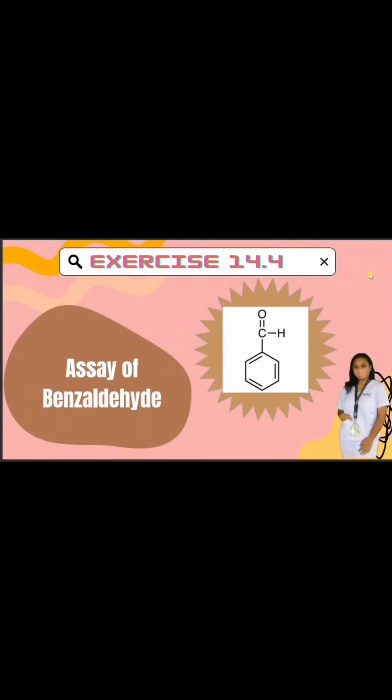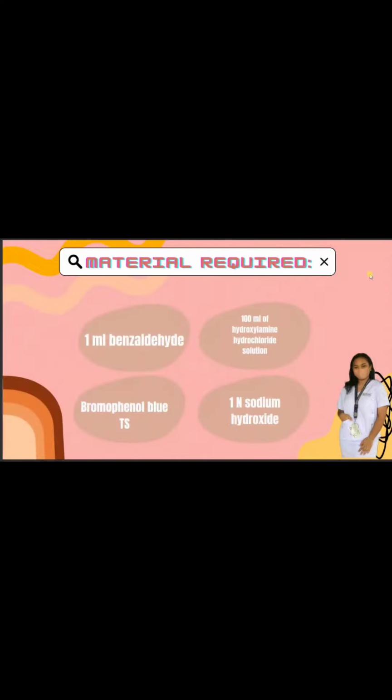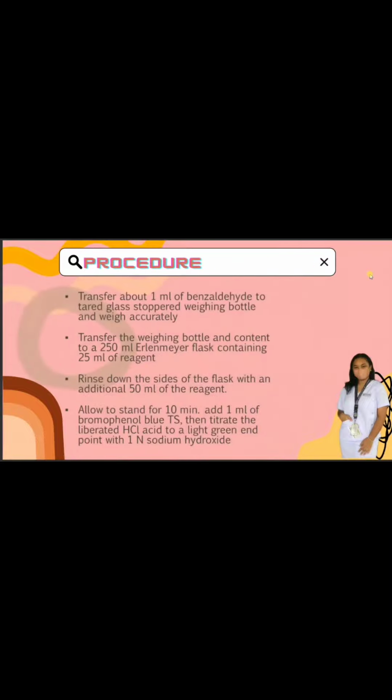So, in exercise 14.4, assay of benzaldehyde, the materials required are 1 ml of benzaldehyde, 100 ml of hydroxylamine hydrochloride solution, bromophenol blue TS, and 1N sodium hydroxide.